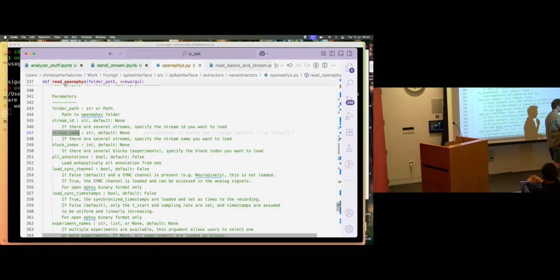So, right, there's two basic approaches. One is either concatenating the two recordings and doing the sorting all at once on them. And then the hope is that if you do some motion correction, if there's some time in between, that will allow it to look a bit more continuous for the sorter. The nice thing about that is that you have a consistent unit ID identification throughout the whole thing. You'll probably get a bunch of splits and that kind of thing. Then you need some sort of tool to maybe do some merging afterwards, like SpikeInterface GUI.